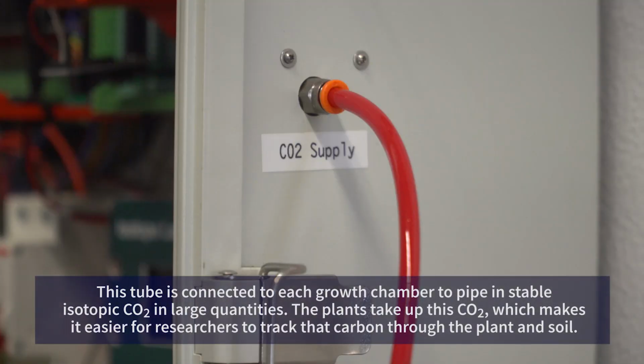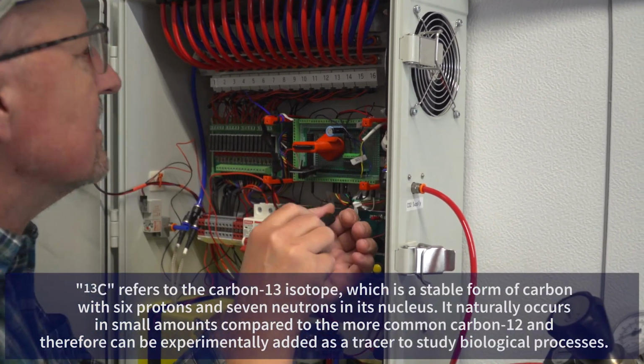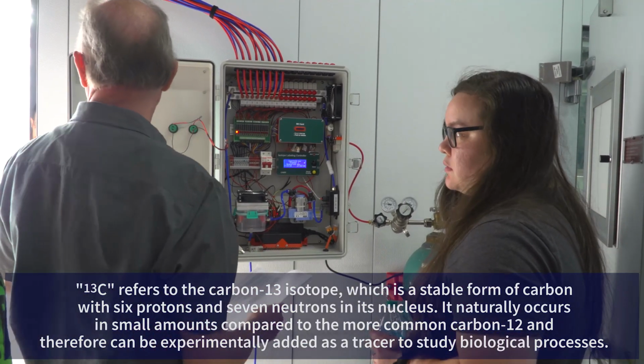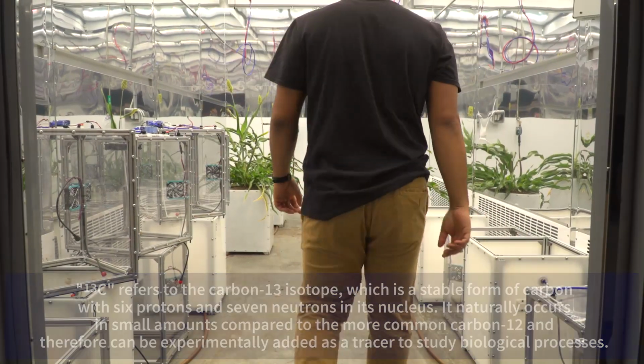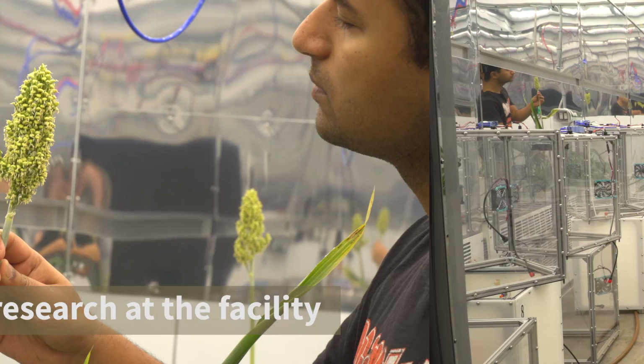Every element on Earth occurs in different stable isotope forms, which means that they vary only in the number of neutrons. This means that they have different atomic mass, but the same chemical properties. We can take advantage of the fact that there's usually a stable isotope form that occurs in very low abundance. So we can experimentally add, for example, for carbon, C13, in large amounts, and therefore we can trace that C13 from carbon dioxide into the plant, into different compounds within the plant, and into the soil, and actually into the DNA of the microbes that are utilizing that carbon from the plant.